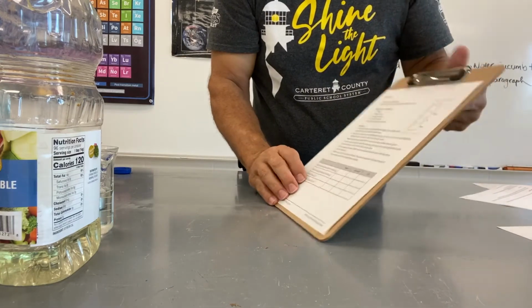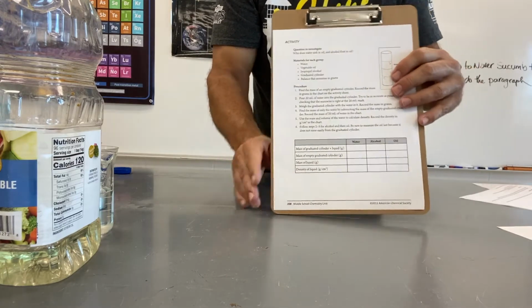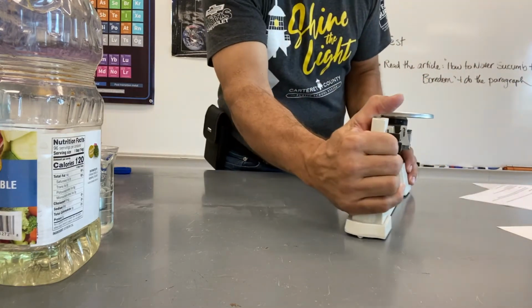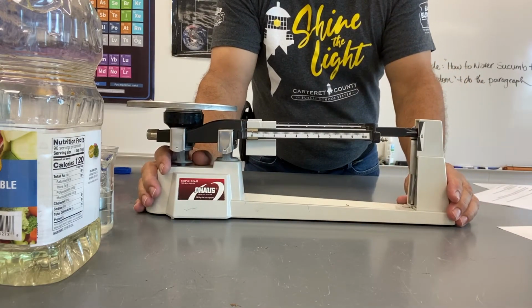We are going to move on to our next phase here, where we're going to be measuring the density of the liquids that we just worked with. So to do that, I have a scale here. Make sure I've got that where you can see it fine.